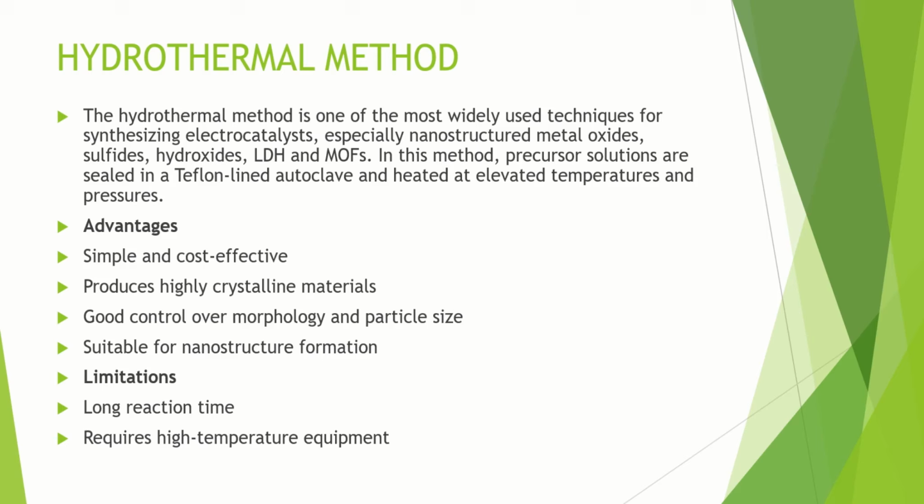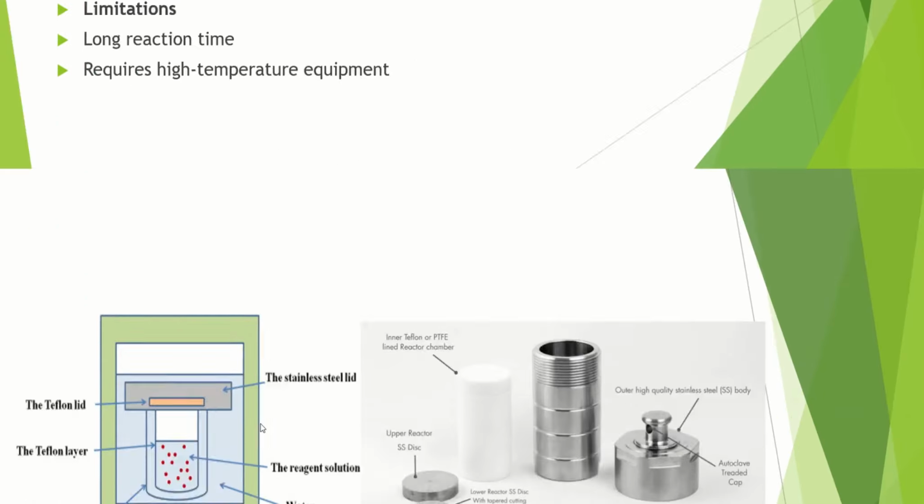The big advantage is that it's simple and cost effective, and it gives you highly crystalline materials and you get really good control over the morphology and particle size. That's why it's perfect for making specific nanostructures. But there are some limitations. The reaction time is usually very long and you need special high temperature, high pressure equipment.